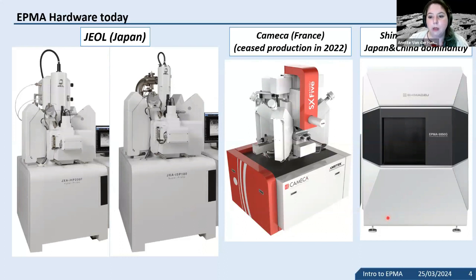All these different manufacturers have slight differences in how they do electron microprobes, slight differences in their tools, and so occasionally I will comment on that. But what is important to note as an end user is that usually they are not one size fits all analytical recipes or techniques, because they're often specific to the hardware, not only of the manufacturer, but also the specific configuration that a lab bought.